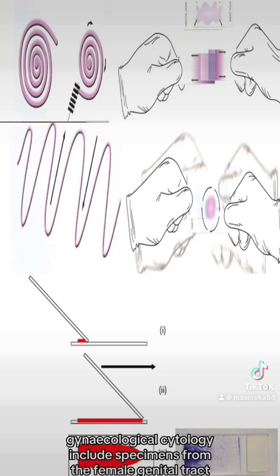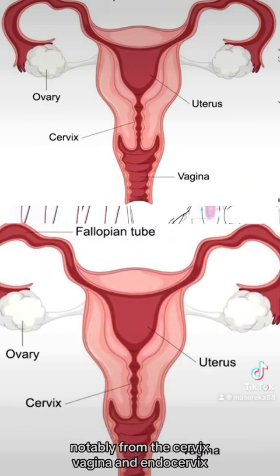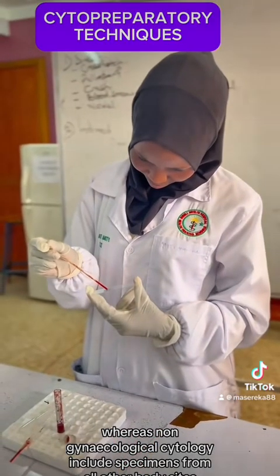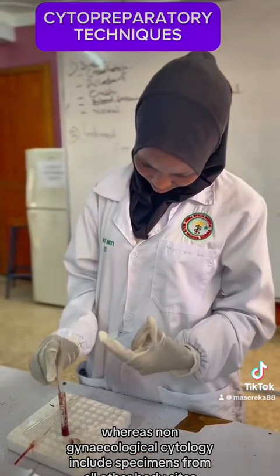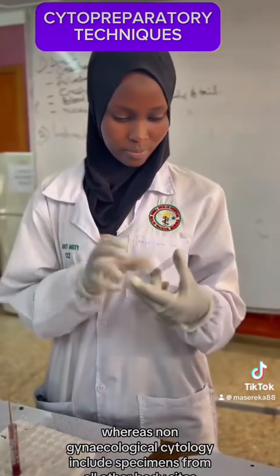Cytological specimens are obtained from any body site and are generally categorized as either gynecological or non-gynecological. Gynecological cytology includes specimens from the female genital tract, notably from the cervix, vagina, and endocervix, whereas non-gynecological cytology includes specimens from all other body sites.